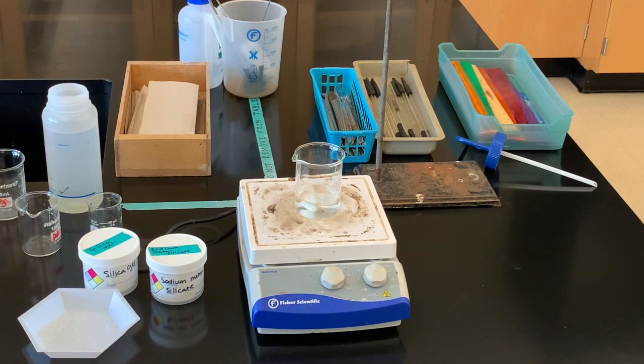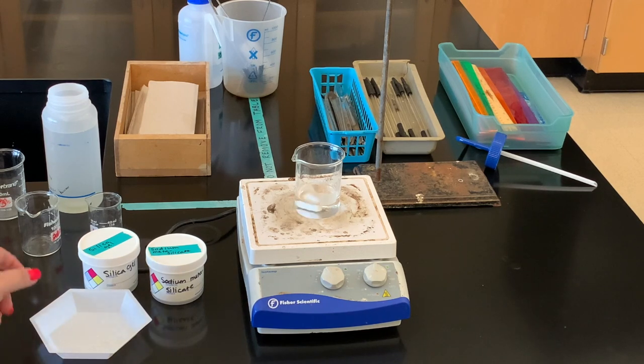Inside this beaker, which you can see is stirring and also heating, I have about six grams of sodium metasilicate, and then in a separate container I have about three grams of silica gel. I'm heating this water to about a boil and then I'm going to slowly add the silica gel to it. It does take a good while for the silica gel to dissolve in the water.